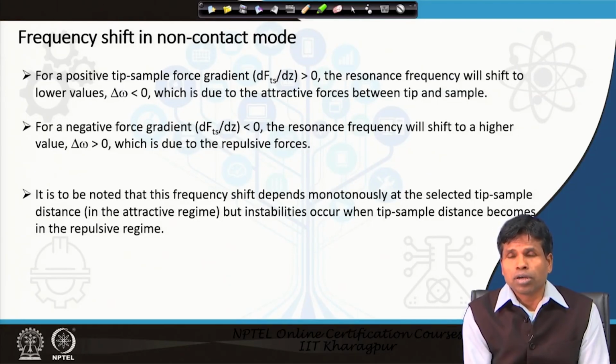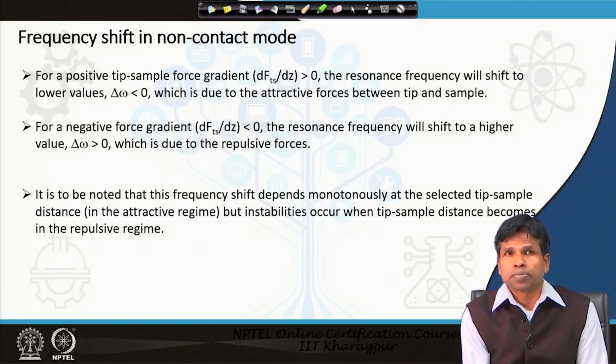So, the frequency shift of the oscillation from its intrinsic value can tell us whether the interaction is strong or weak.